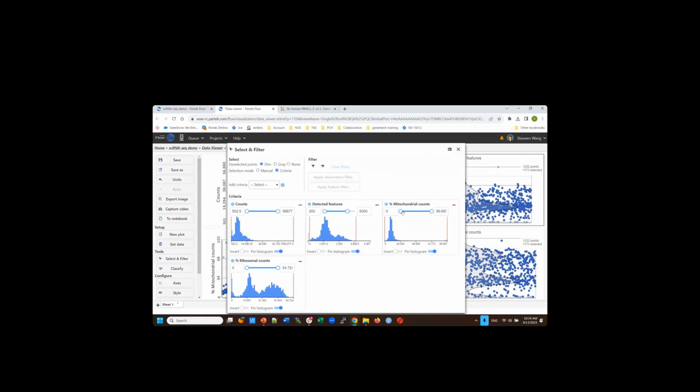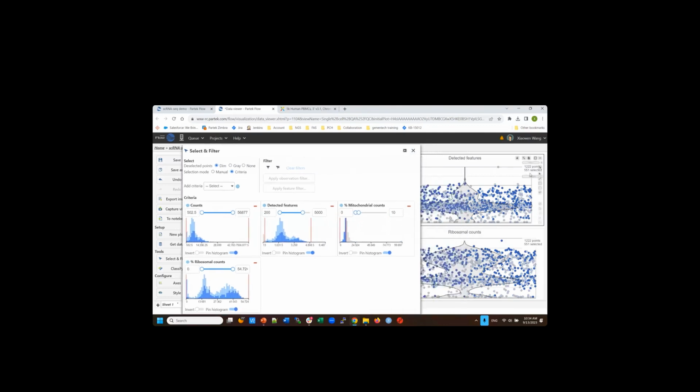And in the meantime, for the mitochondrial percentage, if I say, hey, I don't want to include anything greater than 10%, I type that in. Then you look at the data. Oh, half of my cells are gone, and that's too much. Maybe this criteria is not good for this particular study. I'm going to change that. So always look at your data, look at the feedback, and make a decision. And don't just say, okay, well, one paper used 3%, the other paper used 20%, what should I use? Always look at your data, and use common sense to filter it, not too aggressively.